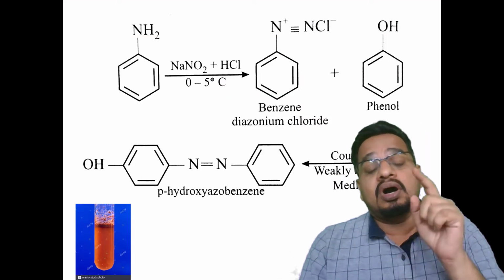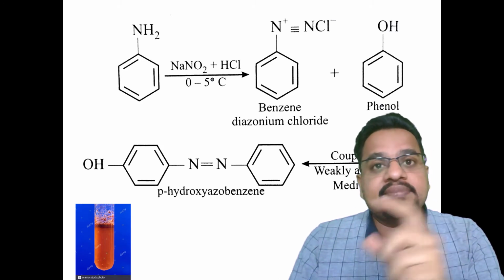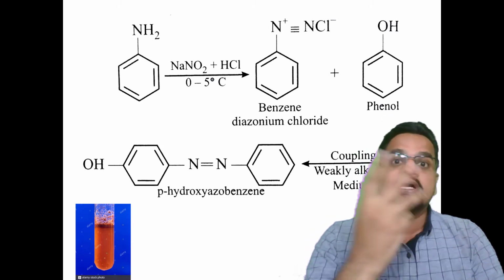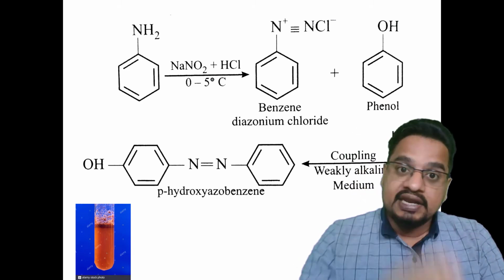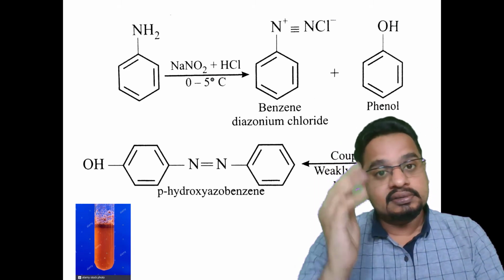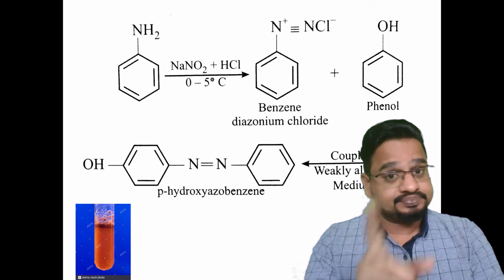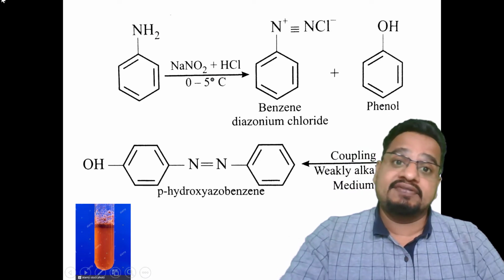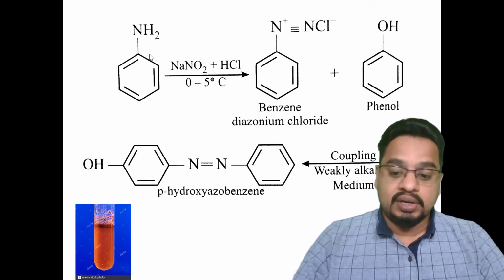This is all you are supposed to write for this test, and many times in the MCQ this is asked. So what the green color is, what the brown color is, the derivatives of phenol and which color they give in the Liebermann nitroso test, that you have to identify.